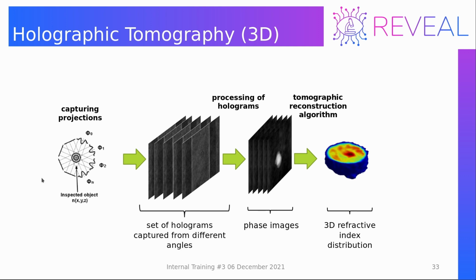So how do we perform the measurements? Let's imagine that this object in the center is our specimen that we measure. We capture a series of projections at different angles.